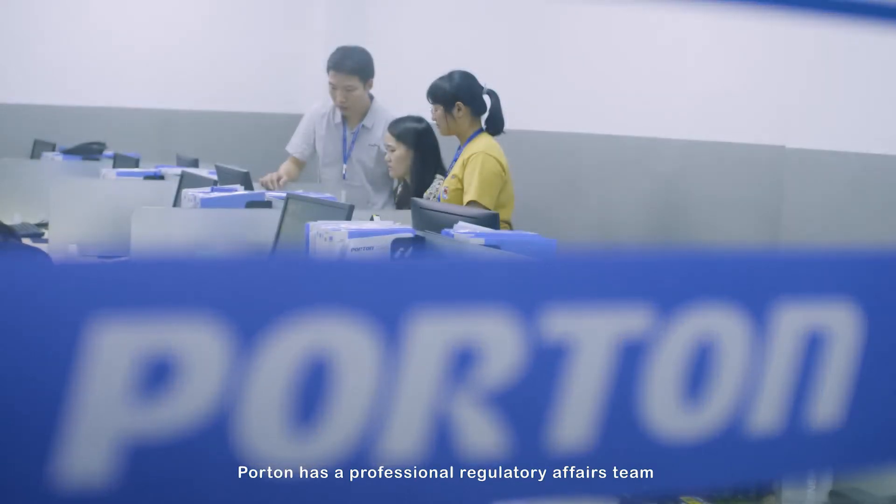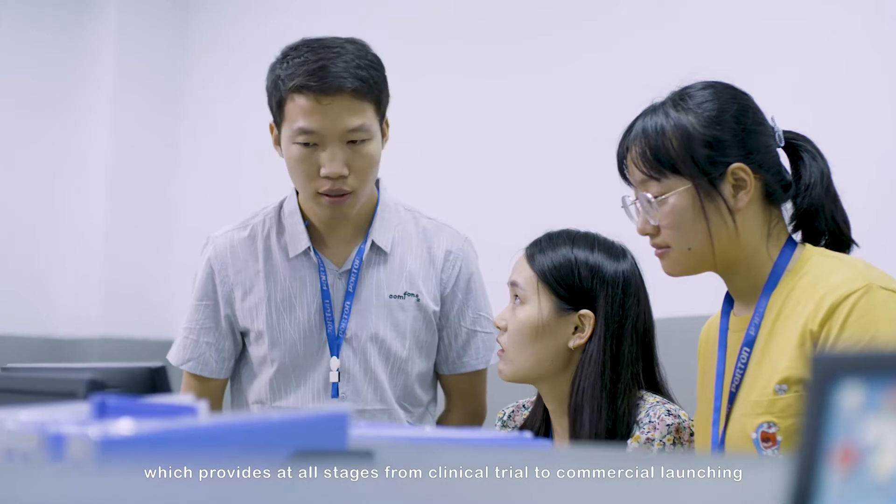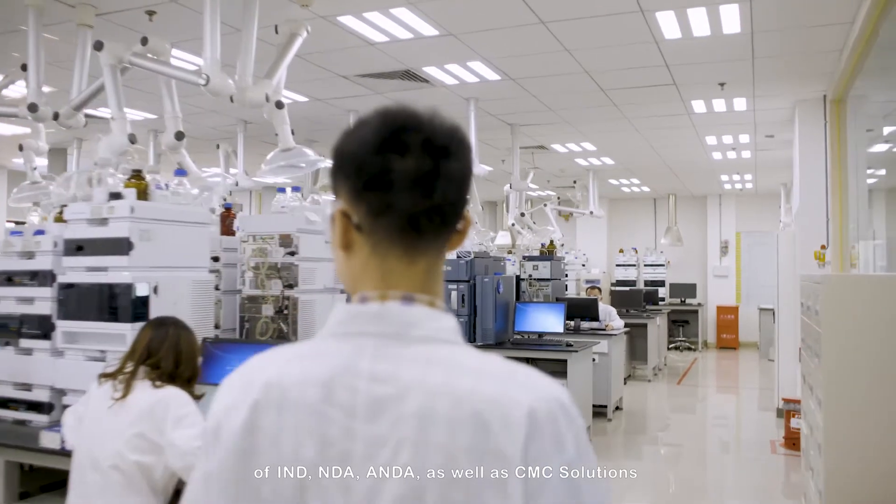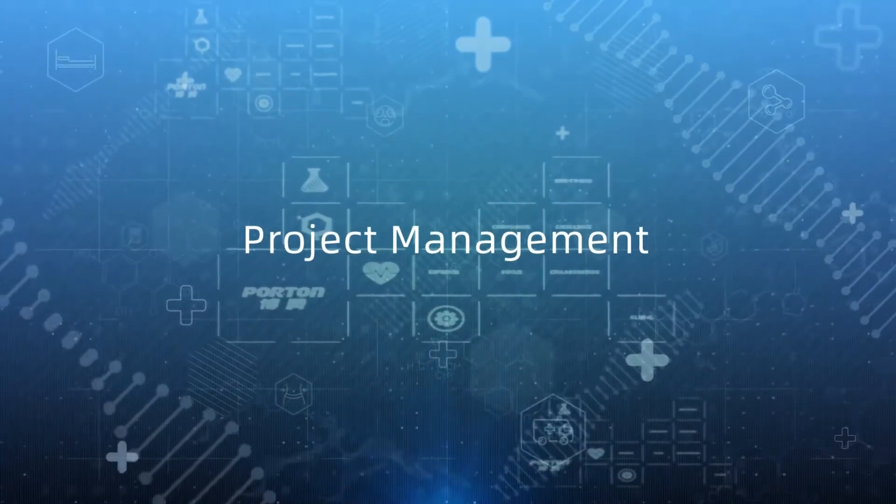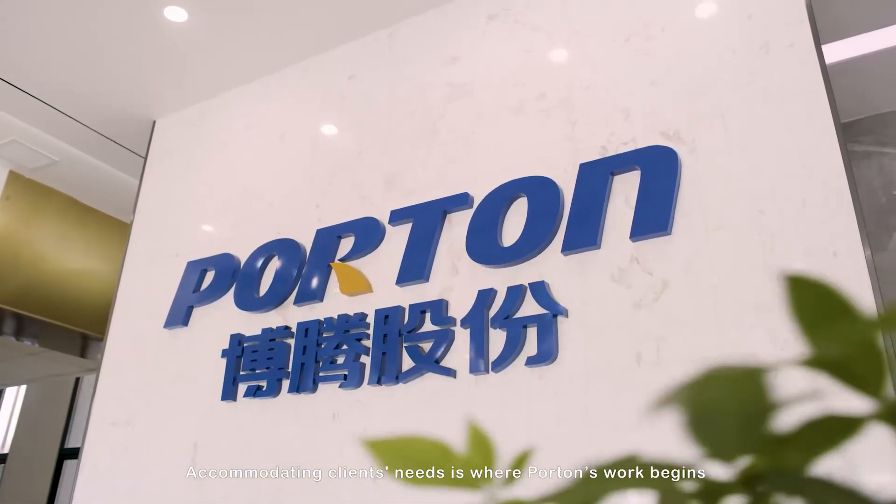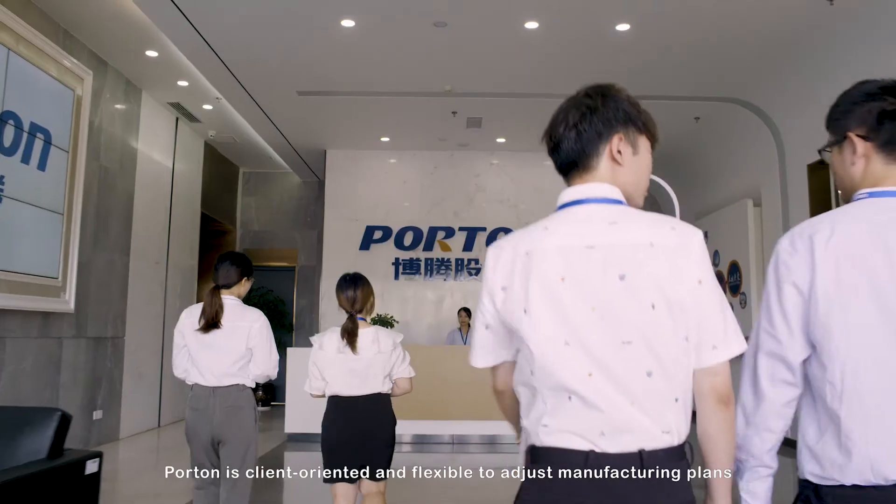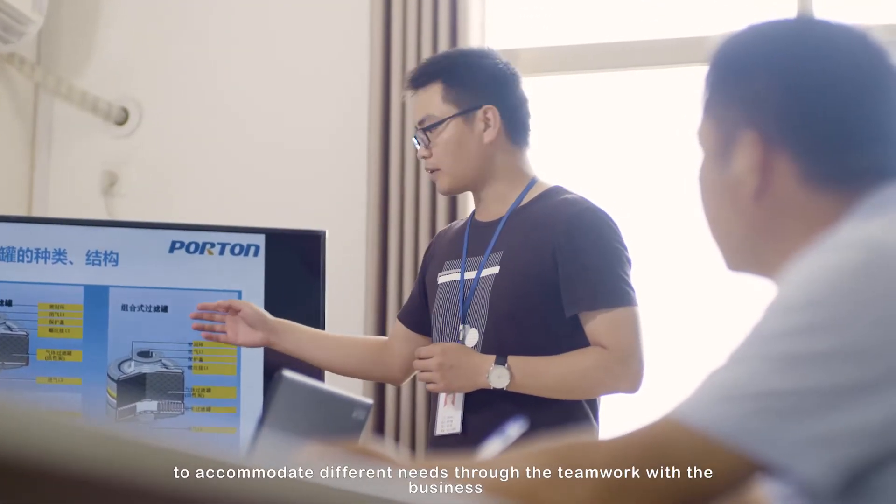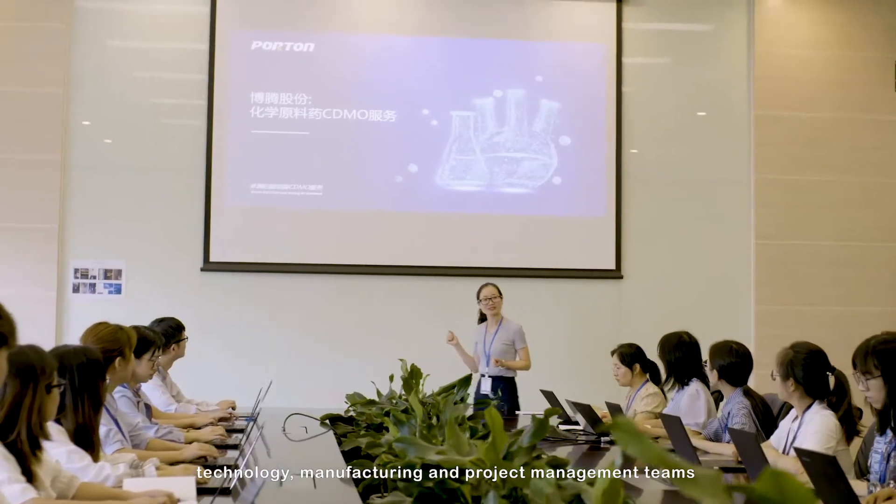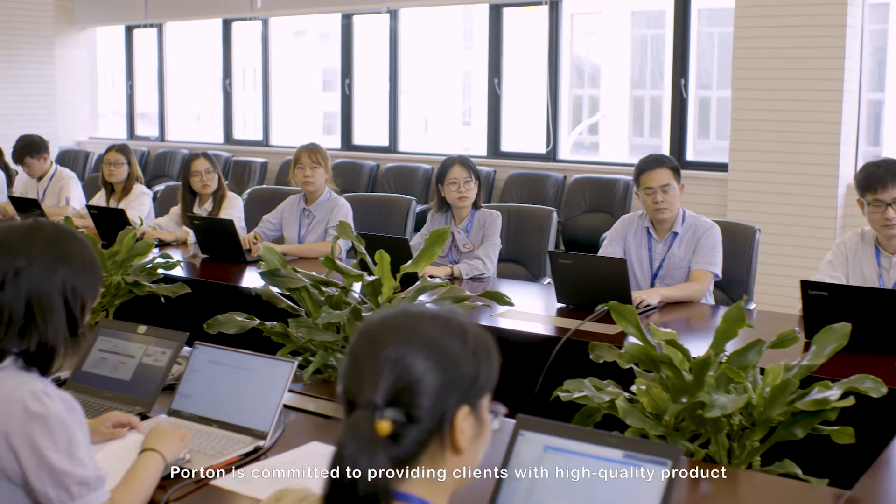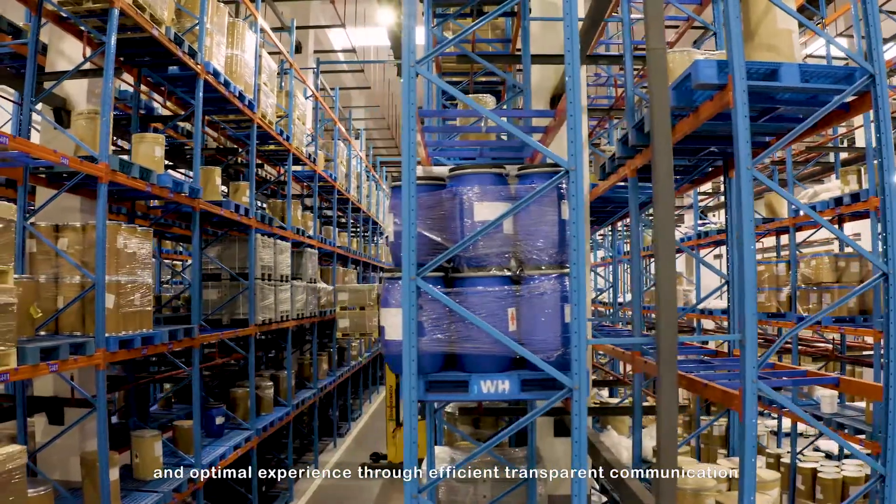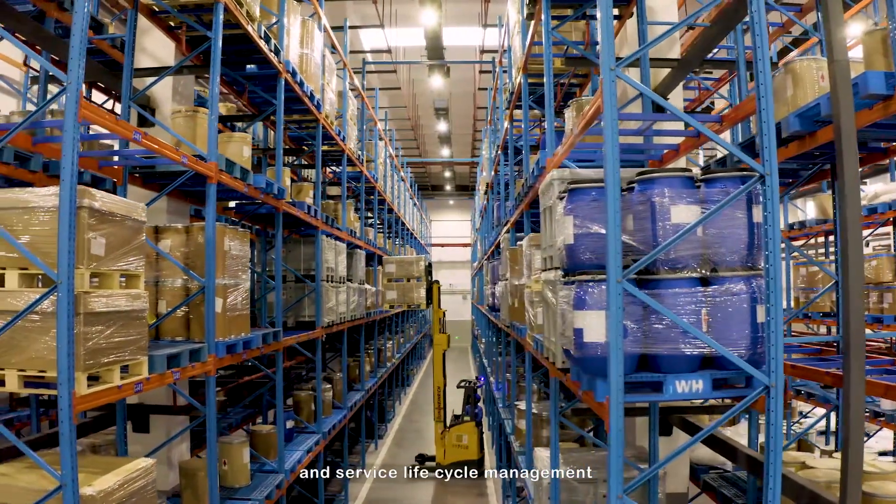Porton has a professional regulatory affairs team, which provides at all stages from clinical trial to commercial launching of IND, NDA, ANDA, as well as CMC solutions. Accommodating clients' needs is where Porton's work begins. Porton is client-oriented and flexible to adjust manufacturing plans, to accommodate different needs through the teamwork with the business, technology, manufacturing, and project management teams. Porton is committed to providing clients with high-quality products and optimal experience through efficiently transparent communication and service lifecycle management.